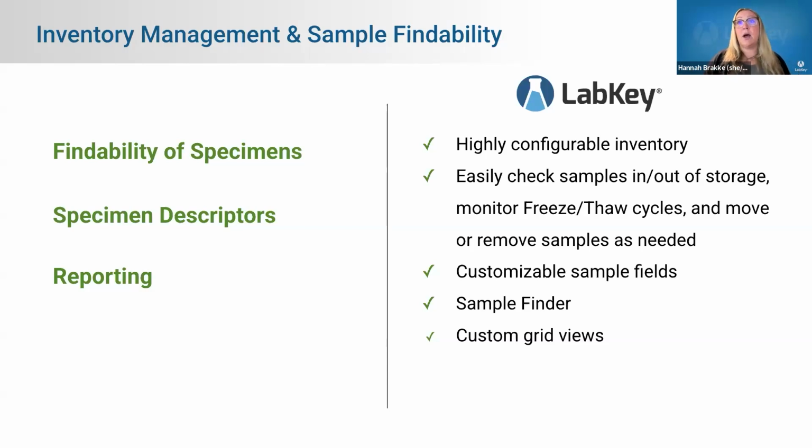We also are placing a lot of importance on biobanks to customize their own sample descriptors or sample fields. And so making sure that you are empowered and have the control to be able to adjust what data you're capturing on each of your samples is very aligned with how ISBER best practice wants us to be able to query and find that data.